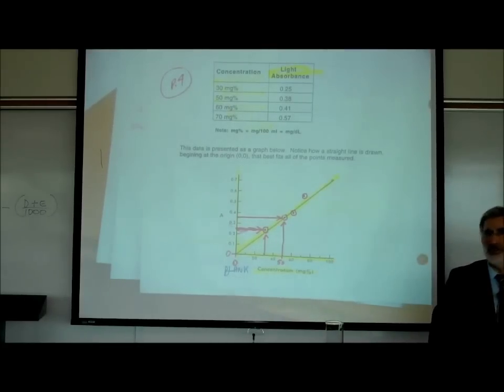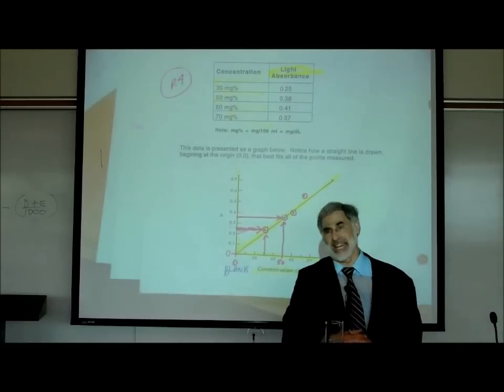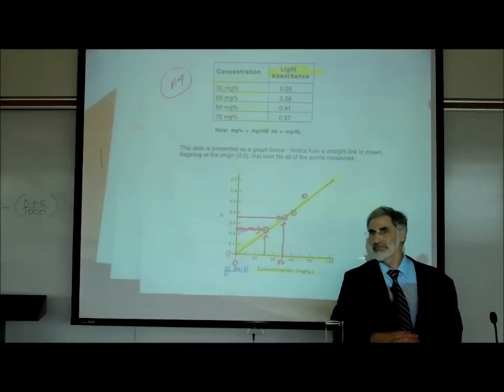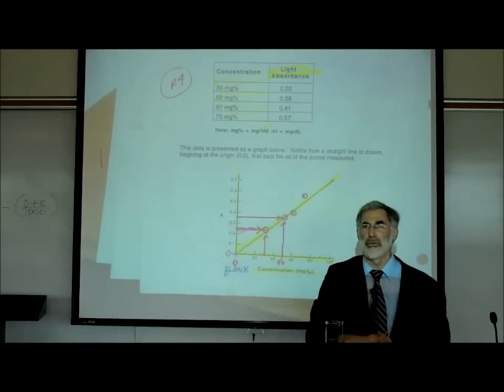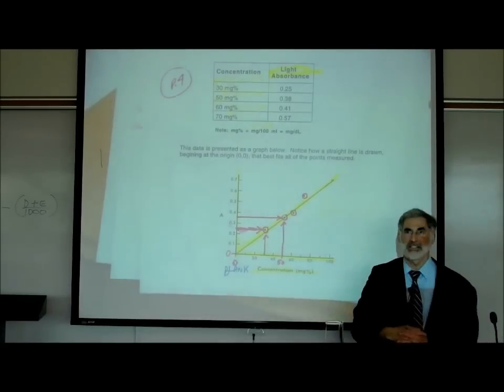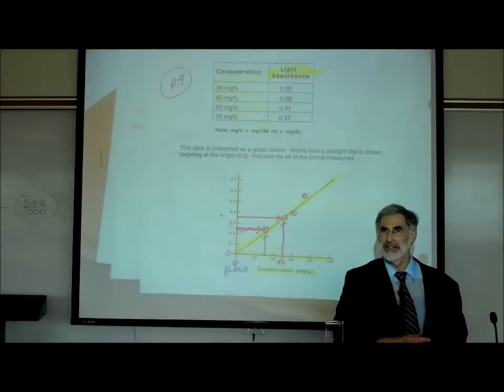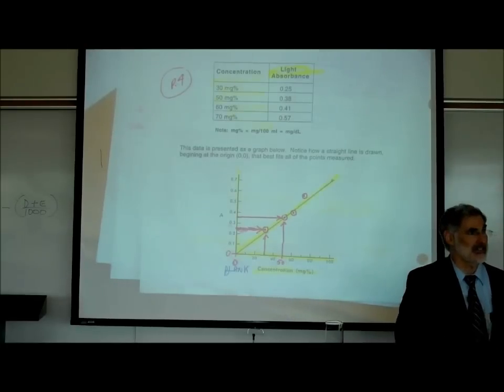And you learn some about this in chemistry, and you learn even more in organic chemistry. Who's had orgo? All right, so did you cover all kinds? You learn about UV absorption and infrared absorption, and that's really what you spend a lot of your lab time on, absorption spectra of different organic molecules, right? And use those absorption spectra to determine what kind of chemical it is.